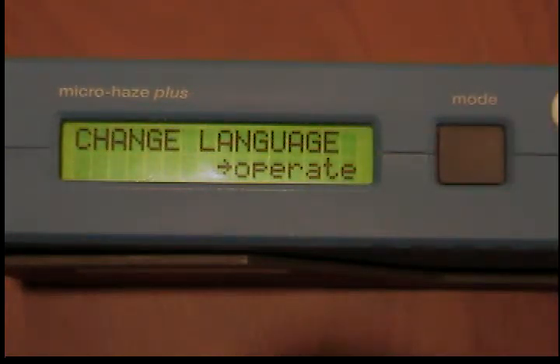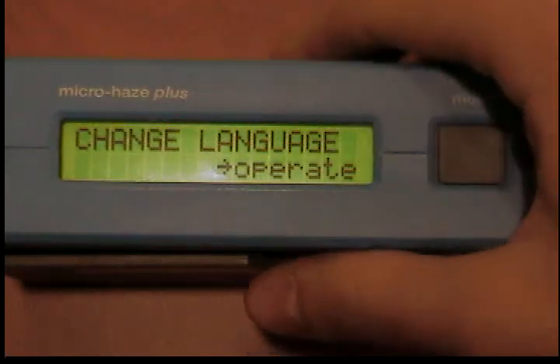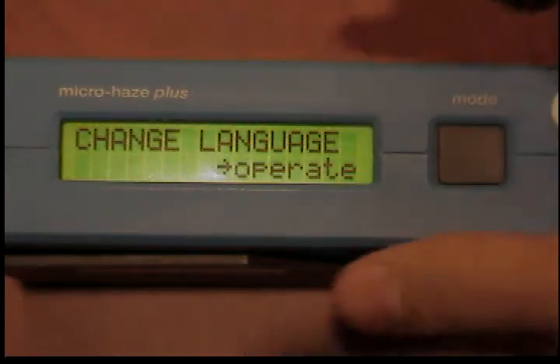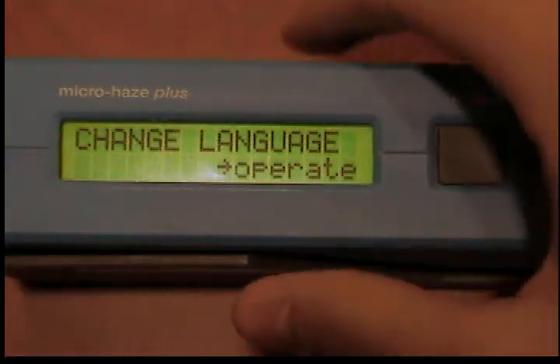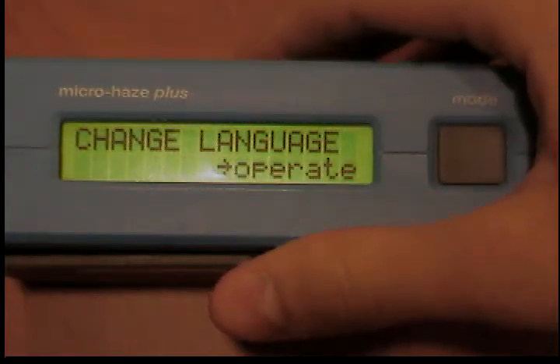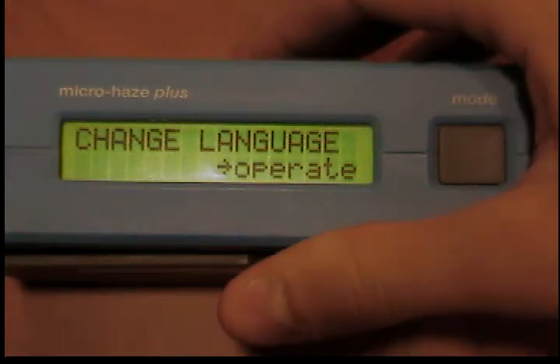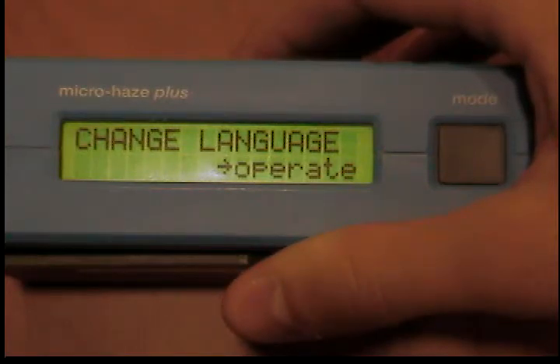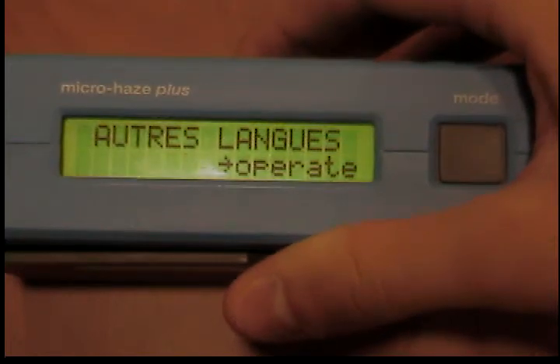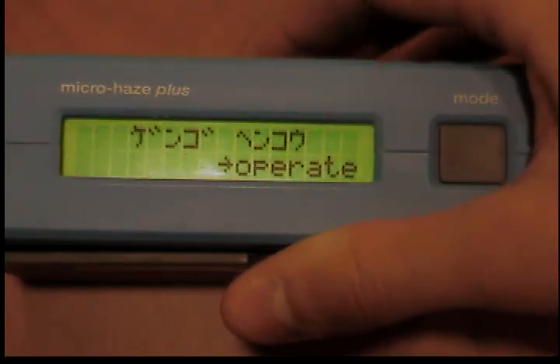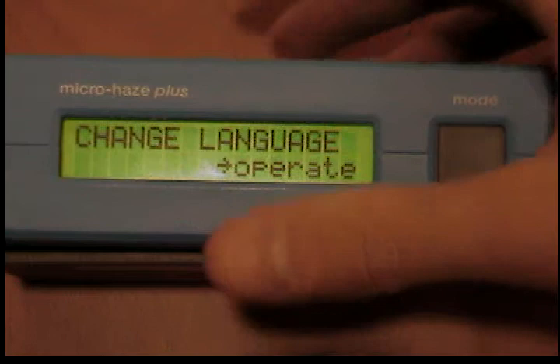Changing the language. The writing in the display of the measurement unit can be selected to be German, English, French, or Japanese. To change the language, insert the measurement unit into the protective holder and switch the unit on by using the mode button. By pressing the mode button several times, skip over calibration and measuring routines until one of the displays shown here appears. Activate the operate button until the desired language version is displayed. Confirm by pressing the mode button and skip over routines until the measurement mode disappears.